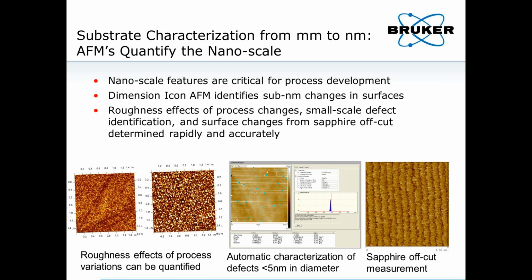Here we have nanoscale features demonstrating the ability of the AFM to measure things like roughness and defects at the nanometer scale.